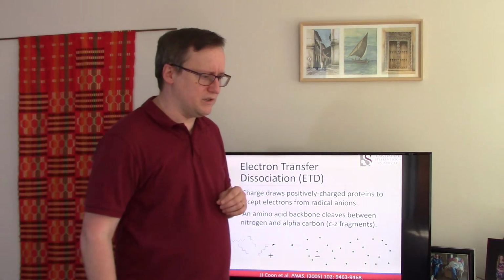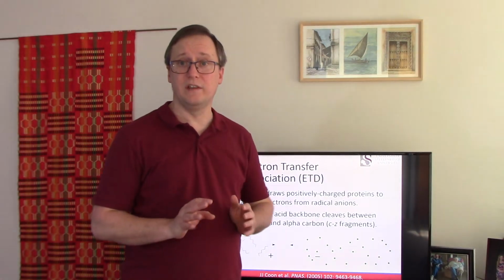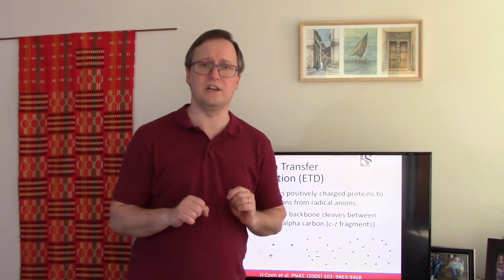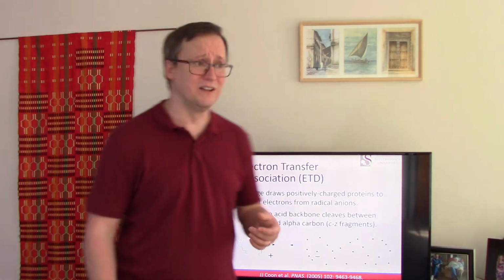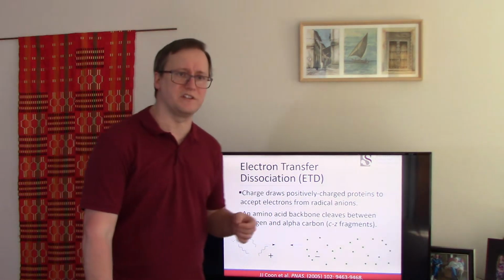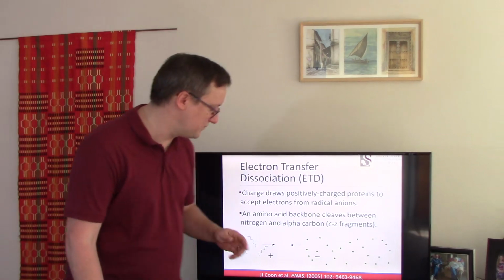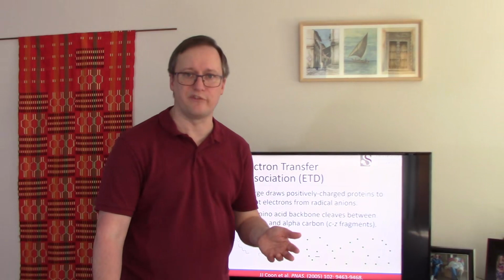Now, Josh Coon and a whole bunch of other great folks put together a really cool technology that circumvents a lot of these problems for collision-induced dissociation. You might think that bashing this peptide with a whole bunch of impacts until it falls apart is a bit of a disruptive process, and you'd be correct. So electron transfer dissociation is intended to be a very gentle process by contrast. In this case, the gas molecules are not really playing much of a role at all.